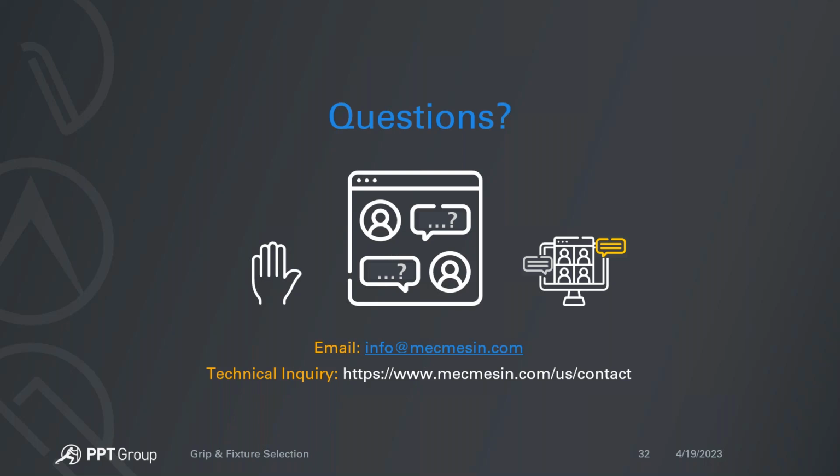Thanks, Moses. Next question. Do you have a recommended fixture for holding an implantable pulse generator, or IPG, for connector insertion and retention force testing?